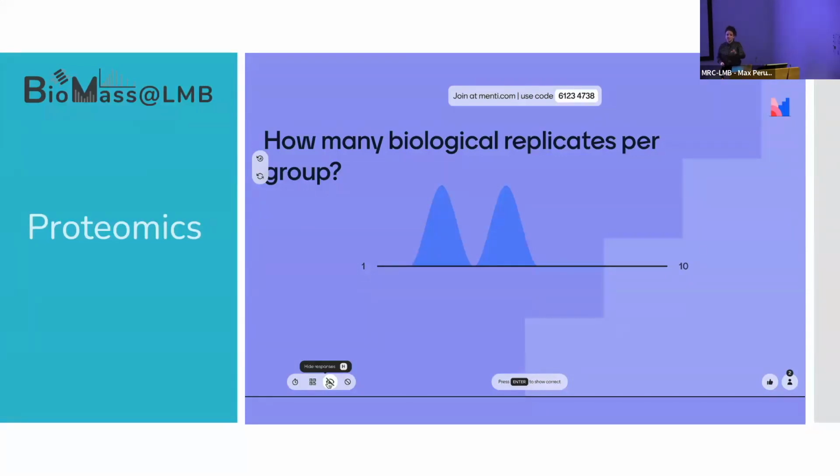So what we usually do is, let's have a look first. You can bring me one sample just to see if everything is okay. There's no major contaminants. We actually see something on your sample. And then please, let's do 3 biological replicates. It's always better to make sure that we can account for the variability within your sample, because that's actually what's going to dictate the number of biological replicates that you need.